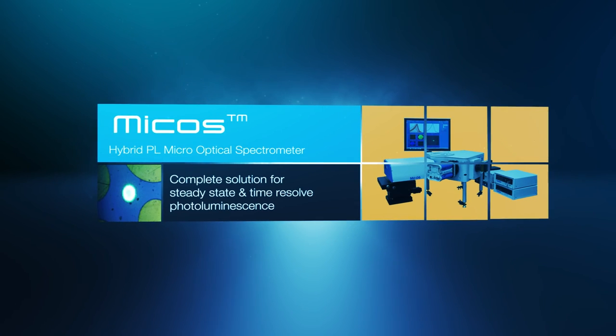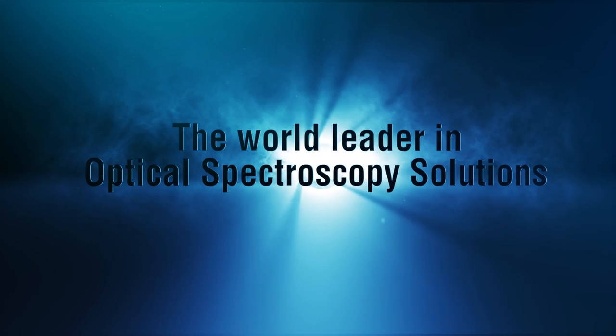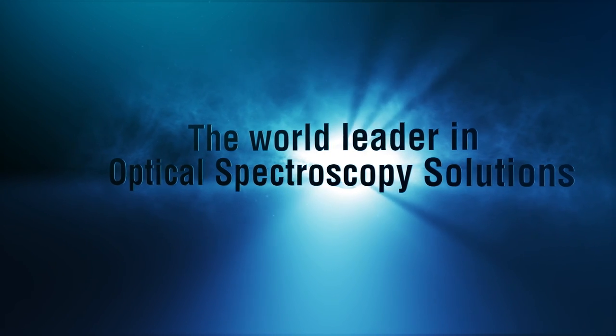Streamline your material research with the MICOS Hybrid Photoluminescence System from the world leader in optical spectroscopy, Hariba Scientific.